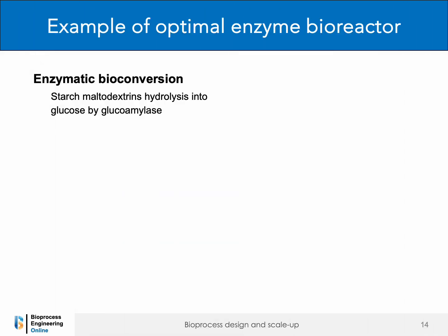To illustrate the impact of the bioreactor technology, consider as an example the hydrolysis of starch maltodextrins into glucose using a glucoamylase enzyme.